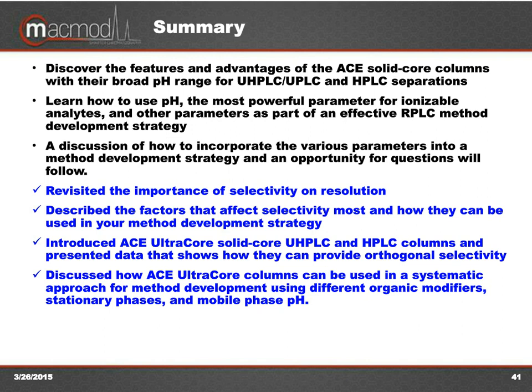I described the new ACE ultra-core solid core columns for UHPLC and HPLC and showed how they could be used over a broad pH range to provide very powerful tools for method development. Showed you diagrams of how they were orthogonal in selectivity when you combine phase change in concert with pH and organic modifier changes.